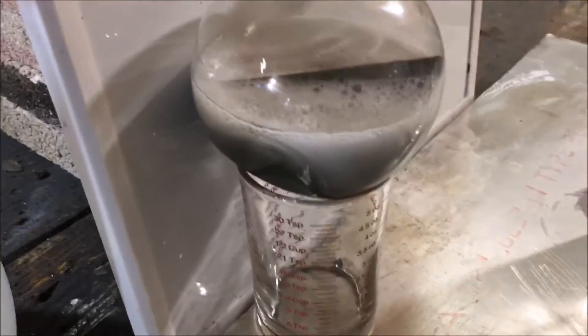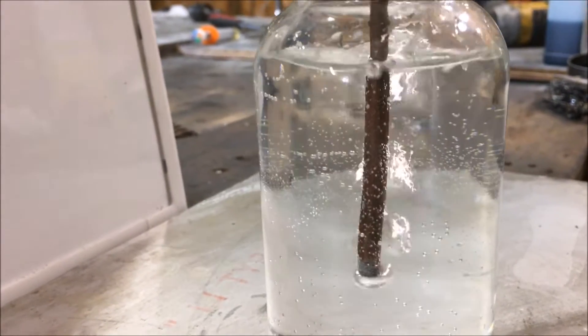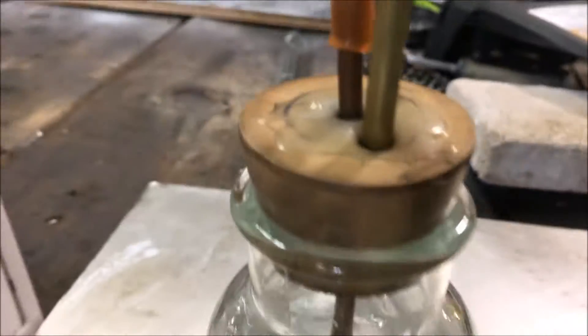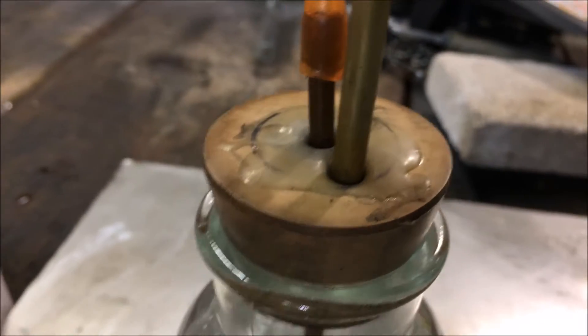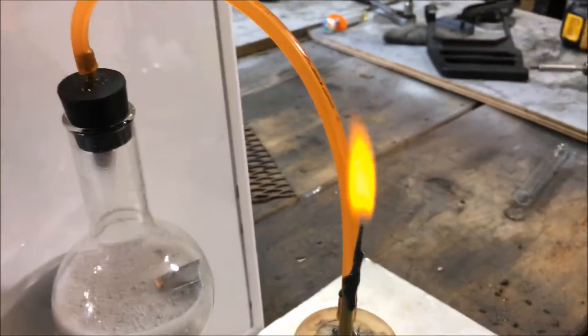This entire reaction is about ready to go thermonuclear on me. You can see it is really bubbling now. This setup might be leaking quite a bit of gas on me too — I need to glue that down. As you can see, it's really starting to go kind of nuts on me here.